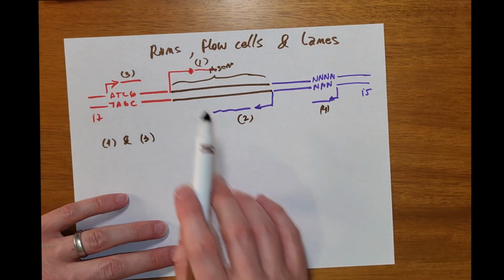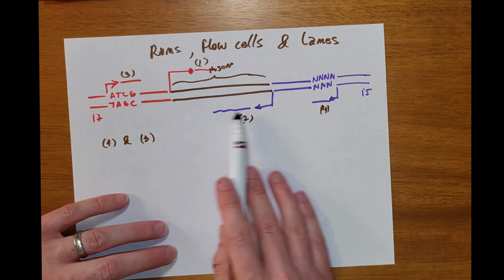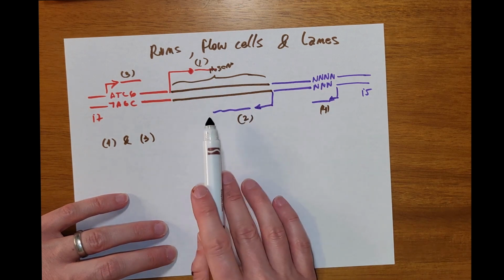However, there is a constraint, and essentially the problem is that in most of the systems, you have to run both lanes using the same combination of reads, like either paired end or single end, a given length from one side or from the other. So this can be tricky if you are trying to use a non-conventional read. For example, you may want to sequence from this end 50 nucleotides and make an asymmetric run by reading like 250 from this end.